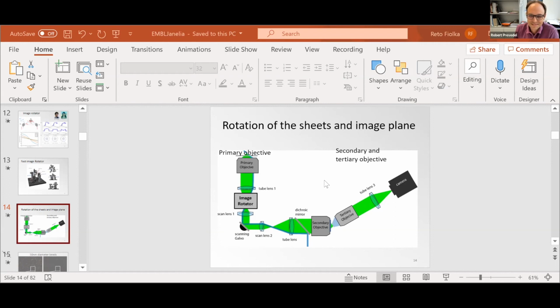But yes, you should get a benefit from fusing. You could imagine if they're slightly tilted to each other, by properly fusing them in 3D you get a little advantage. And the group of Chris Dunsby, I think, did a dual view OPM with a different mechanism, and they 3D fused or used an image fusion algorithm that helped. But that alone will not give you a resolution doubling. Exactly, yeah, that's what I was wondering. But it would be better. It would be better. So there is still something you can improve in Z by properly treating it.